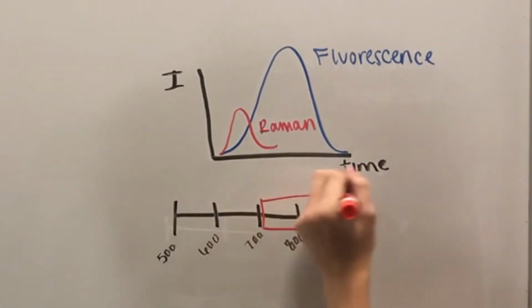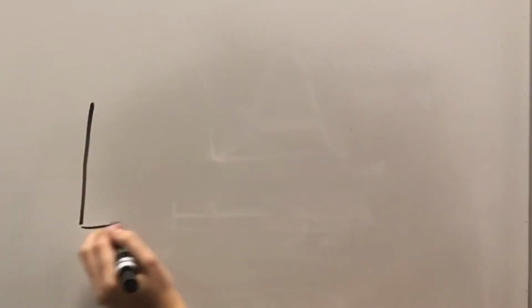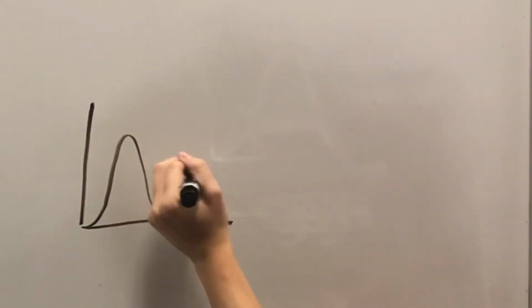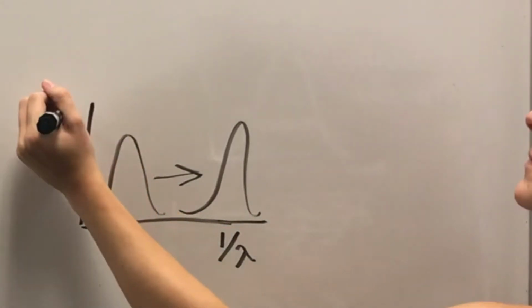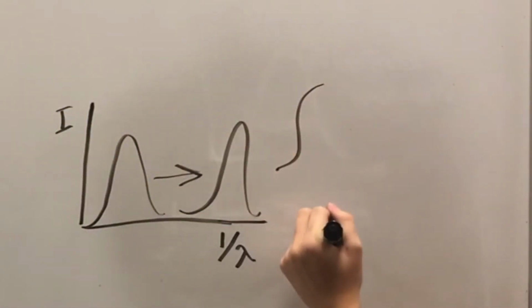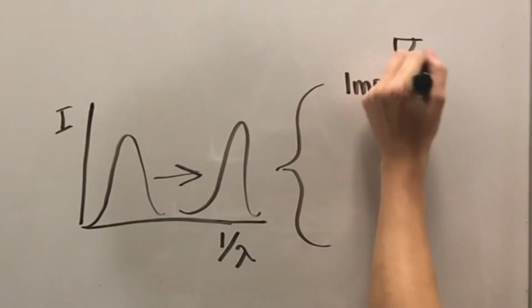Fluorescence is much rarer in this range, but this also significantly decreases Raman signal strength as it is proportional to 1 over the wavelength cubed, requiring much longer scan times. Raman signals can also be shifted by a range of experimental conditions including sample stress, changes in temperature, impurities, non-stoichiometries in the material, and the laser power.